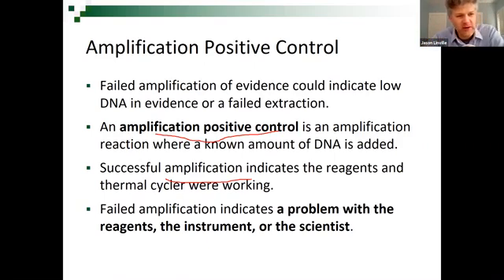Run it again. Very good. Okay, so you do it again, and then that oftentimes will give you a different result. You do it with a different person, you do it on a different instrument, you do it with different reagents. And if it happens again, okay, then you complain.